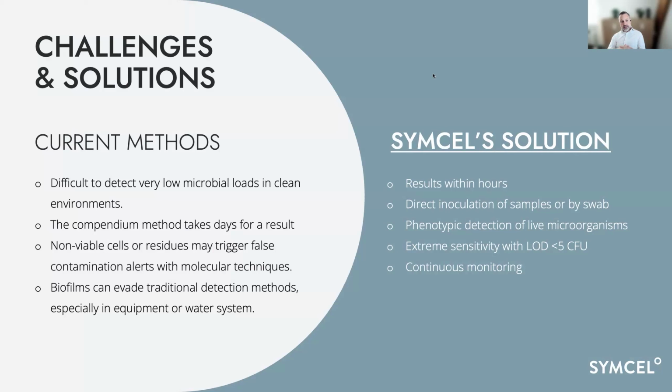They also brought up that these compendium methods took so long that if you had contamination, it could spread and they could lose valuable experiments. And these mice are insanely expensive, so isolating the contamination very fast is very important.